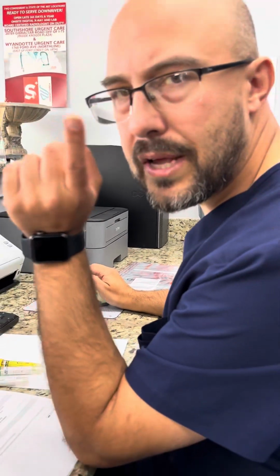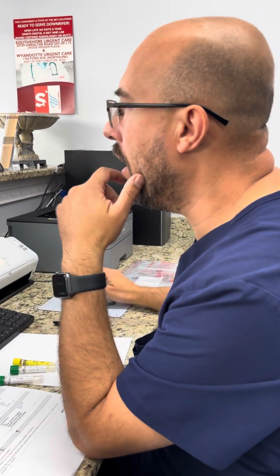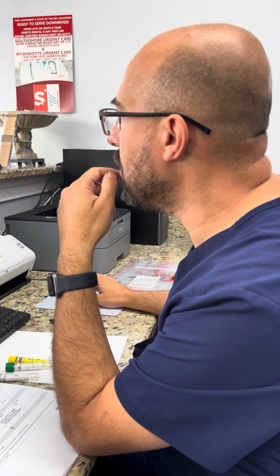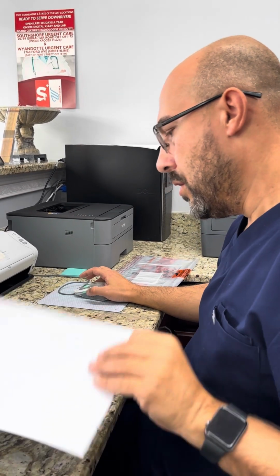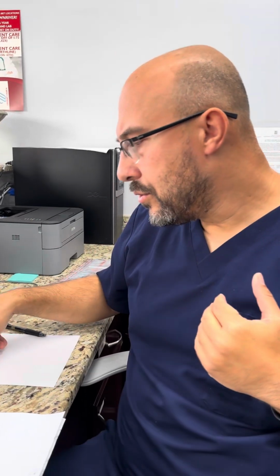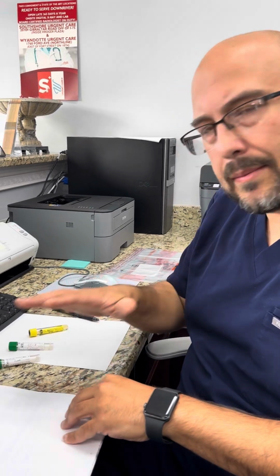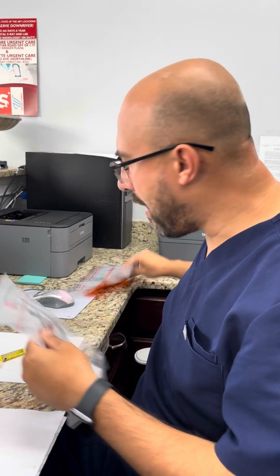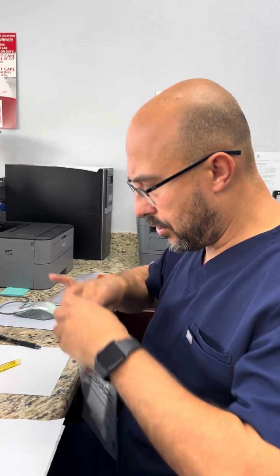We'll find out in a second. Usually, Orchard has their own printer, and usually it's the sticker down and in, but we're just using this one for now. So hopefully, okay. So once the sticker comes out, what you need to do is put a sticker on the sample, and then you are going to get the demographics sheet with the sticker paper. You're going to fold them together. And there are two bags. There's a small bag and a large bag. So you're going to open this up here.